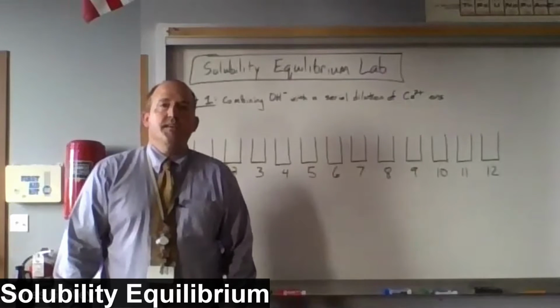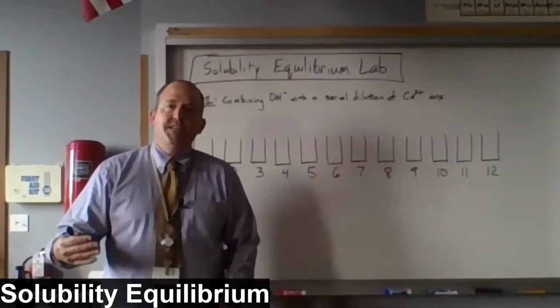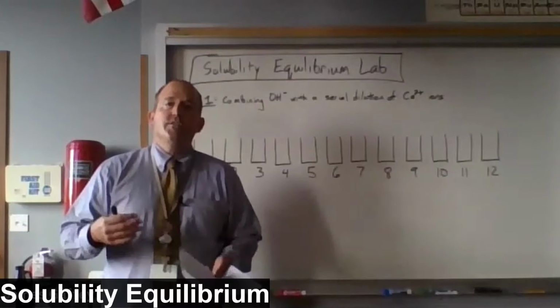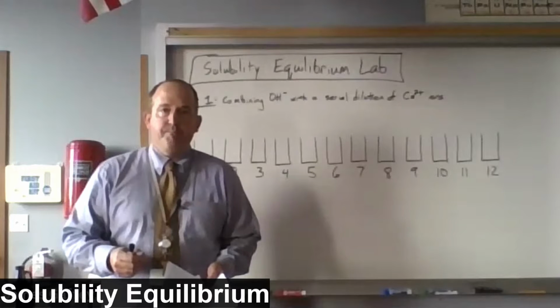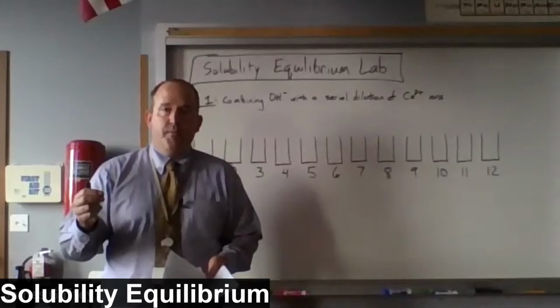Students, this is the Solubility Equilibrium lab. Before we can get into the data collection portion of this lab, we need to talk about a lab technique that is used in this lab that's really important for understanding it. That technique is called serial dilution.